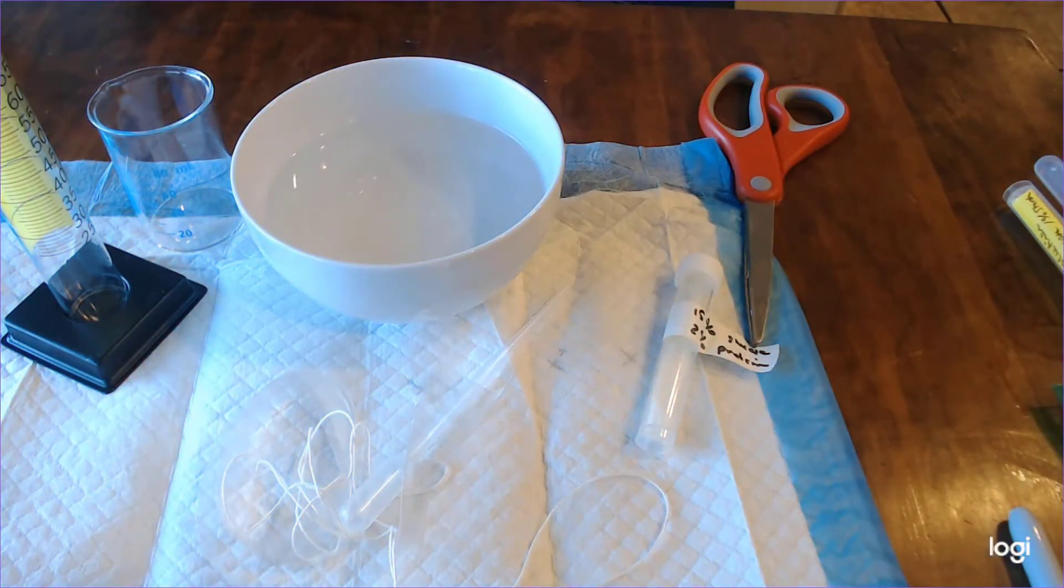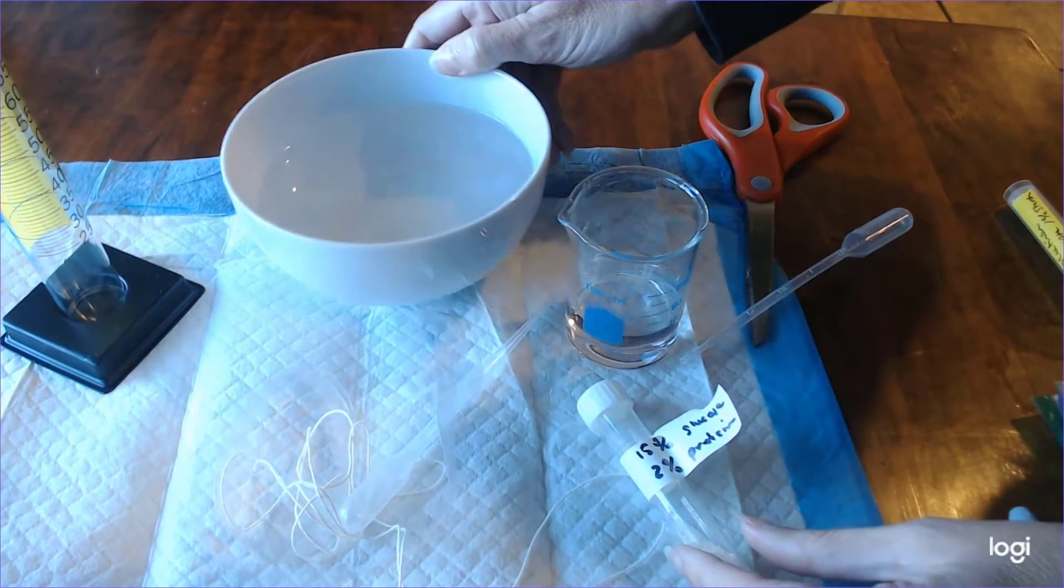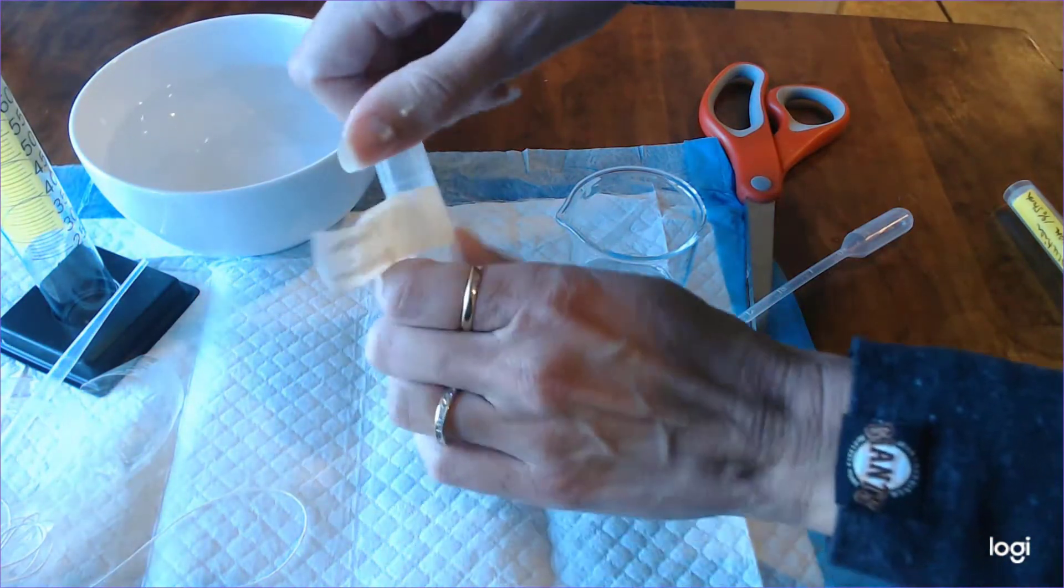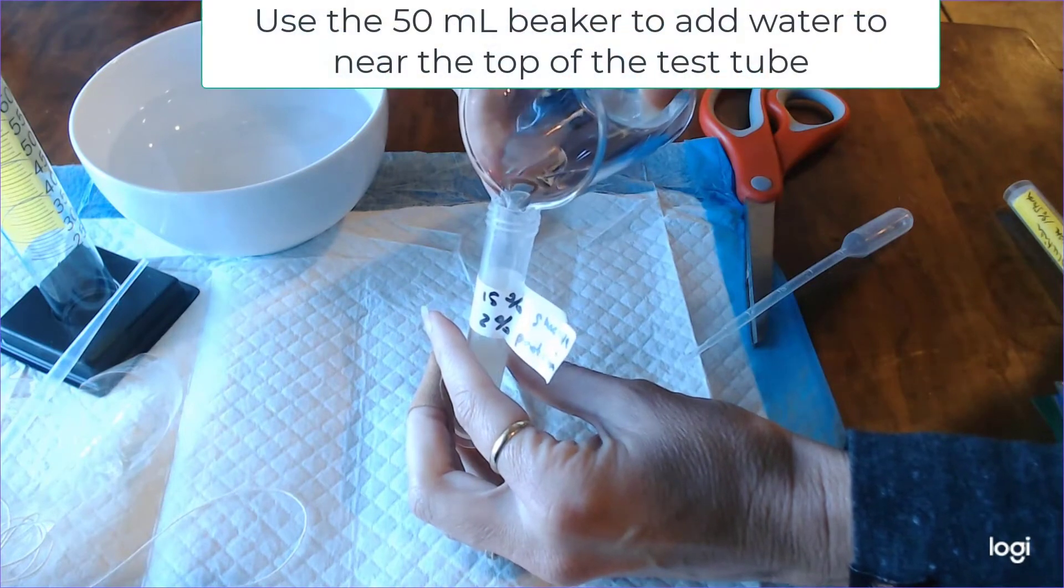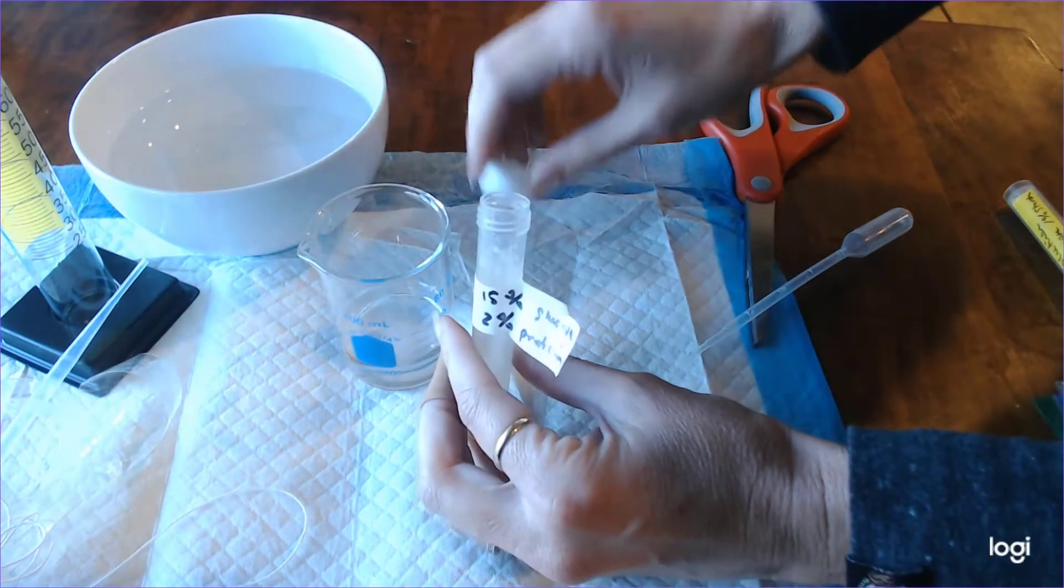While the dialysis tubing is soaking let's work on dissolving the dialysis powder in 10 milliliters of solution. It's a 10 milliliter test tube so we're just going to go ahead and add water to close to the top of the test tube.